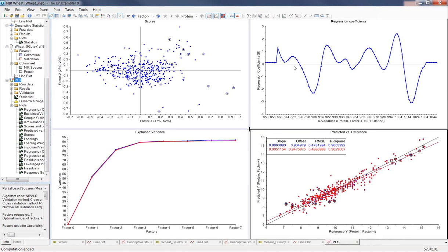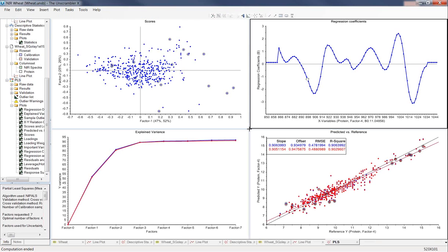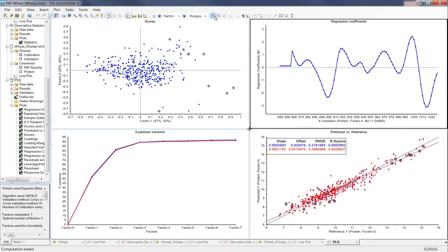Okay, I have a question about the loadings. The pre-processed spectra start and end with zeros due to the filter. That is true. So it starts with zeros here because we did our derivatives, and it has the ends on there. So you can see that they're actually very close to zero. They're not going to affect your data very much. If you want to, you can go in and take those out.